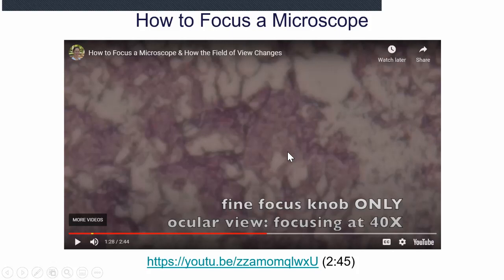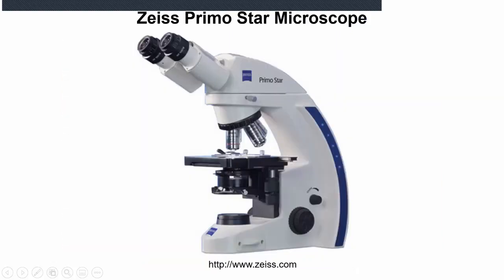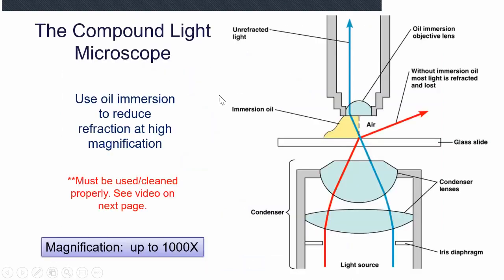So I want to talk about how we use microscopes and what kind of things we can see. There's the one that, of course, we were using in our class. One thing that just pains me is the labs that we're missing here. You are not going to get to do the bacterial lab in person next week.